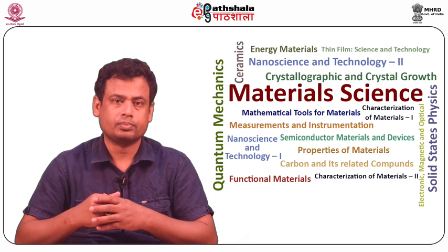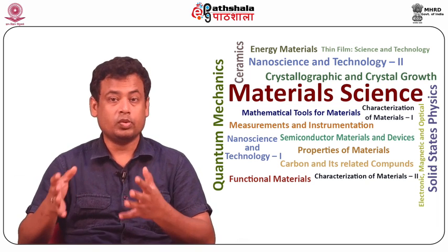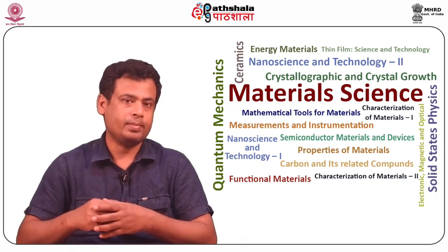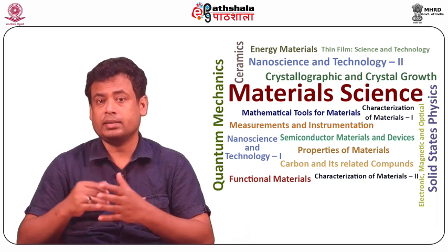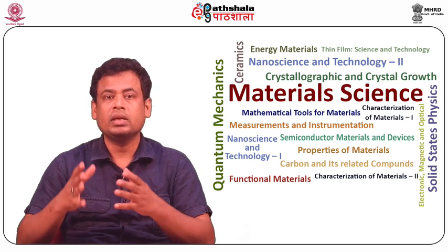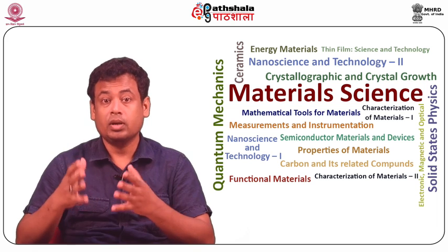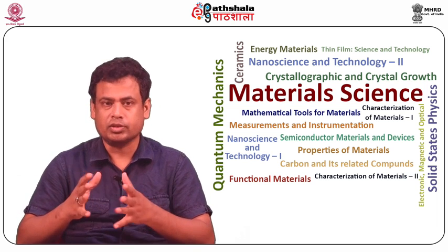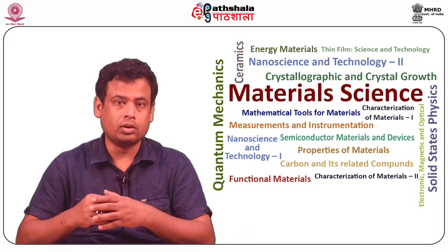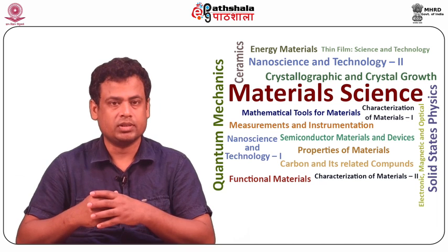So, students, let us summarize what we have learned in this module. In low volt SEM, the image contrast results due to the changes in the secondary electron coefficient from different elements, and this effect is largest when the secondary electron yield is maximum, that is at low beam energies.